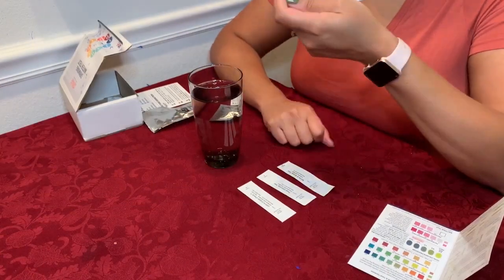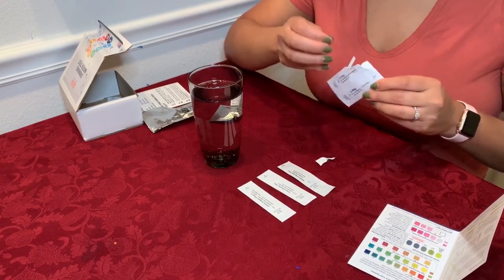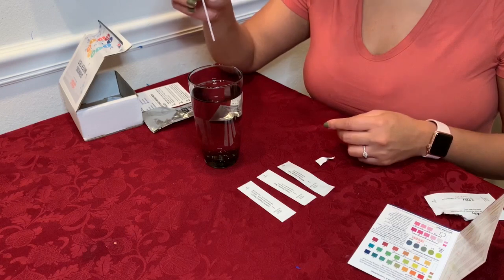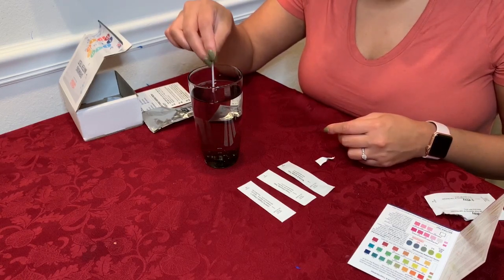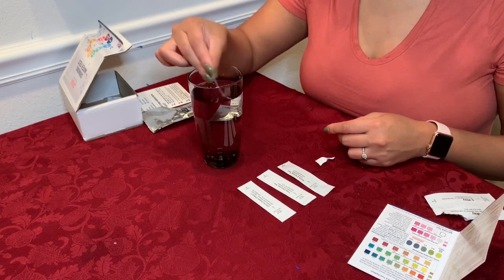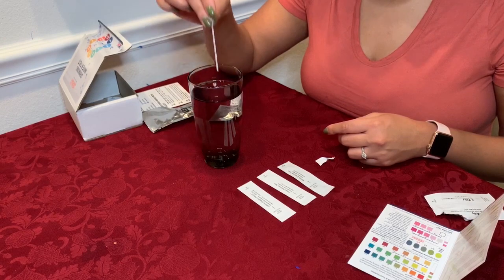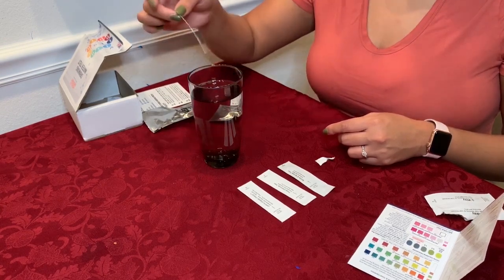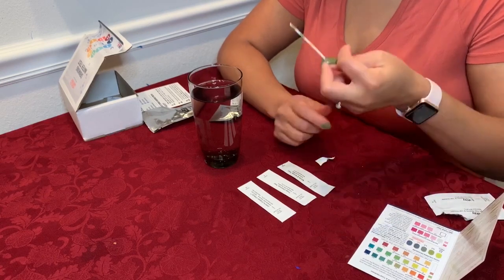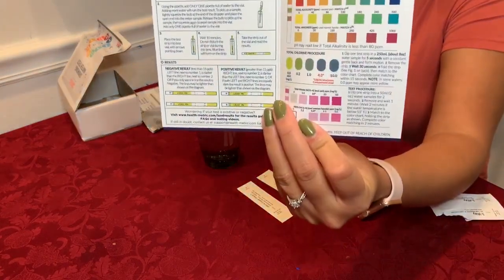Let's do the three-way pH, alkalinity, and total hardness test first. It says just to dip it into a glass of water and gently swirl for five seconds — one, two, three, four, five. Remove and shake out. Now we just have to wait 20 seconds to match to the color bar on the instruction set.